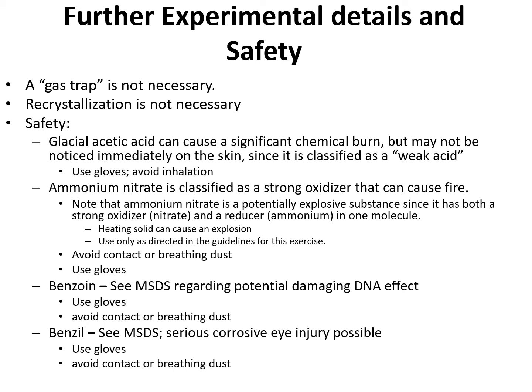When you collect the crystals, try to avoid any dusts that may come from the product.